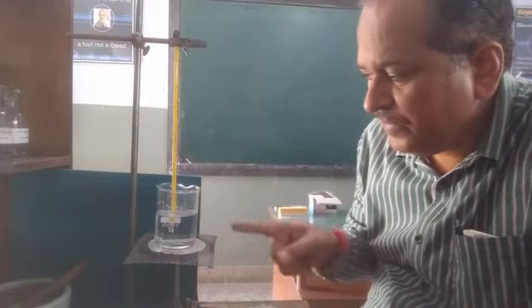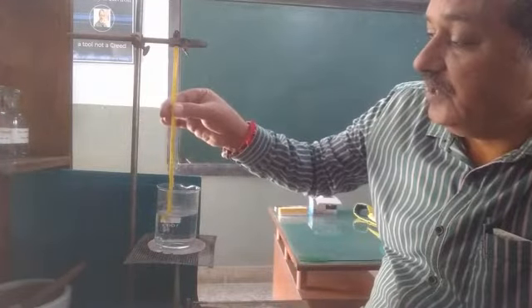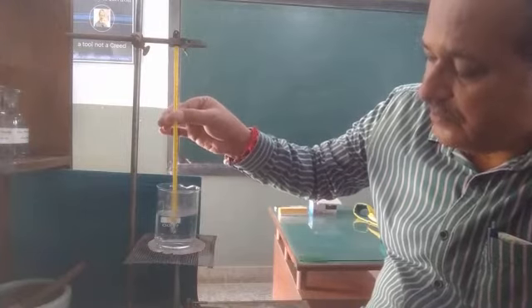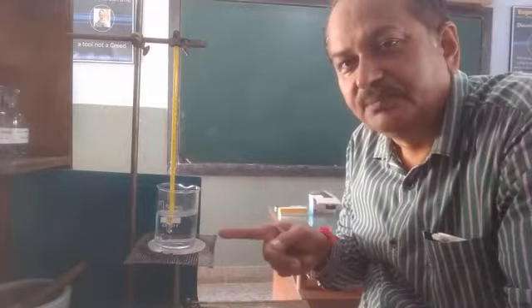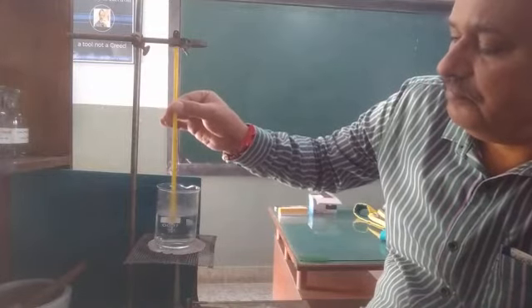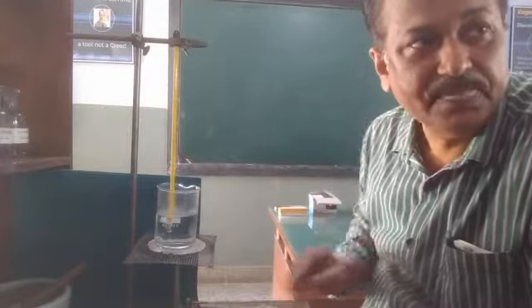You can see it is not yet regular boiling. See, water started boiling, children. You can see the bubbles from the vessel. It has started boiling. So this is the boiling. Now we will show you the temperature, but still it is not 100. A constant temperature is required.